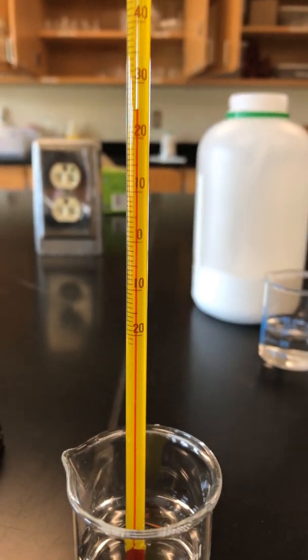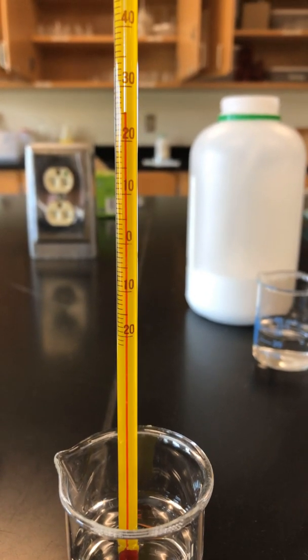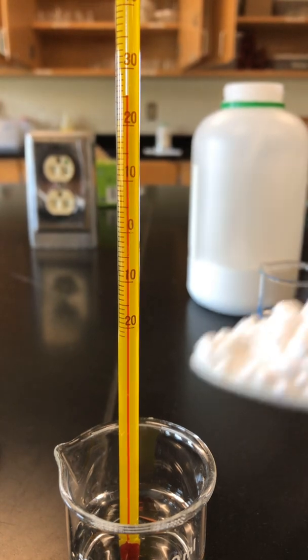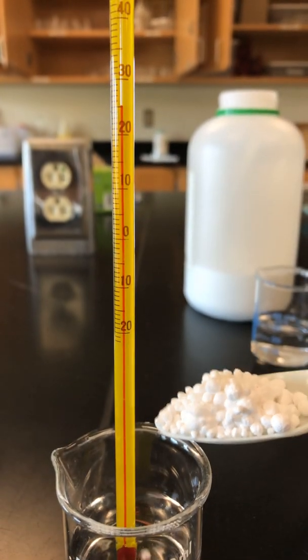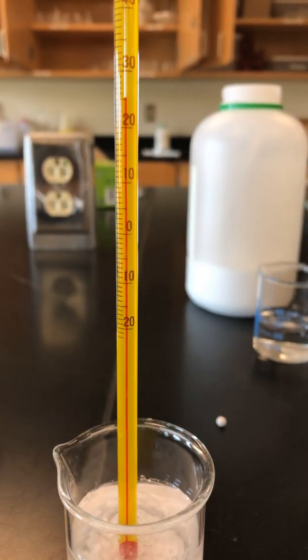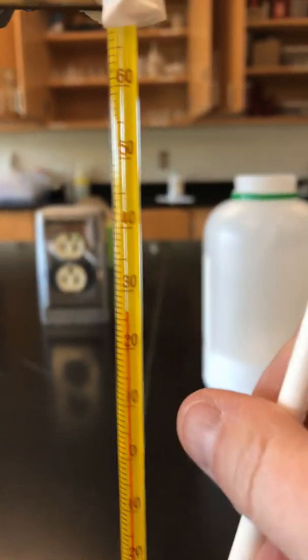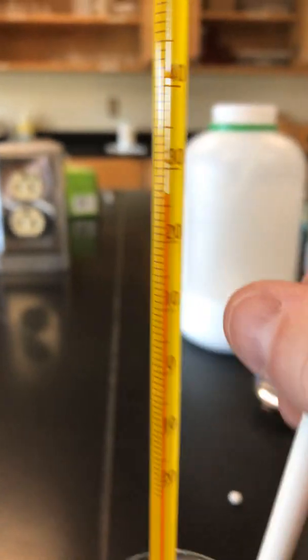Okay. So now what I'm going to do is add a scoop of salt A. So you can see it coming in. I'm going to carefully add it to the beaker, and I'm going to stir it around. And now watch the thermometer.